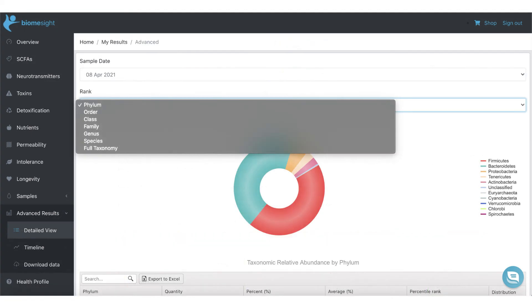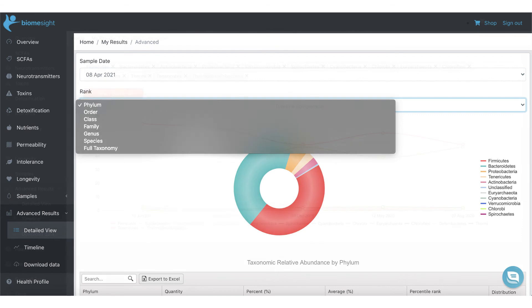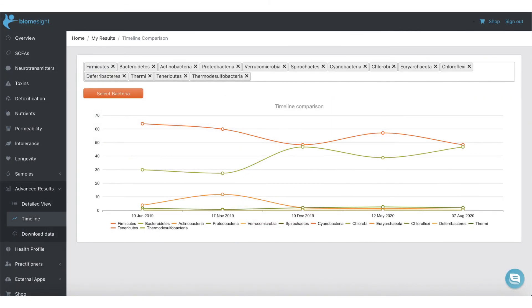On top of all these categories, you can even access a more detailed view in our advanced results section, which allows you to dive deeper into different categories such as family, genus, species, and many others shown here. You can also access a timeline across multiple samples to help you see how much you have improved your gut health.